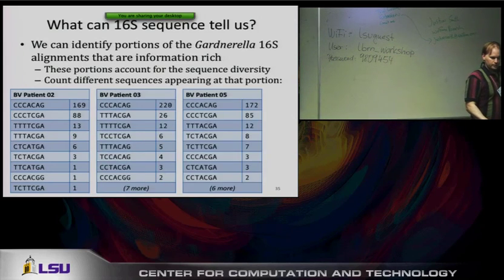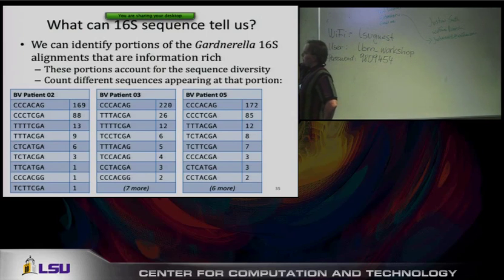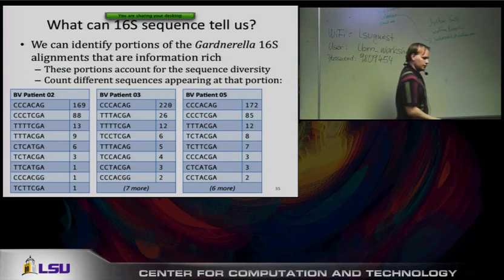So we had three patients we looked at, and what you can see is that each of these has a significant oligotype up at the top, and they have different versions of Gardnerella there.